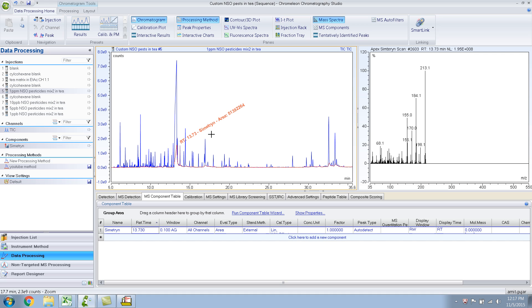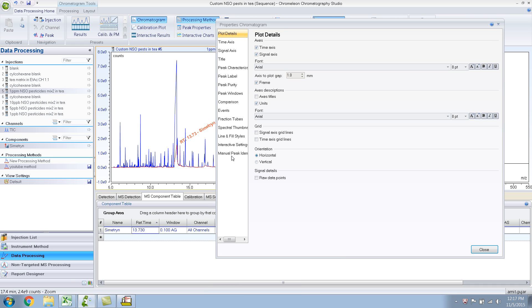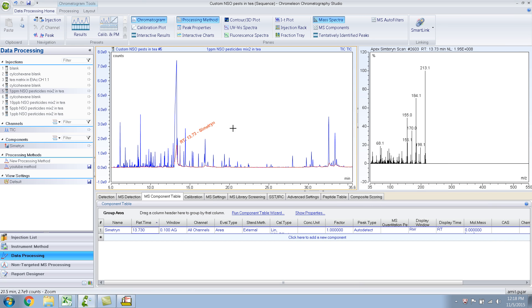You can have whatever label you want. Say you don't want to see the area — you just want to see the retention time and the name. What you would do is go to the properties, and in the peak label tab, under 'label identified peaks,' just remove the area. And if you do that, you should have no area displayed.